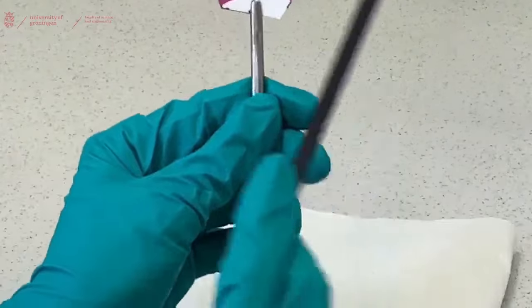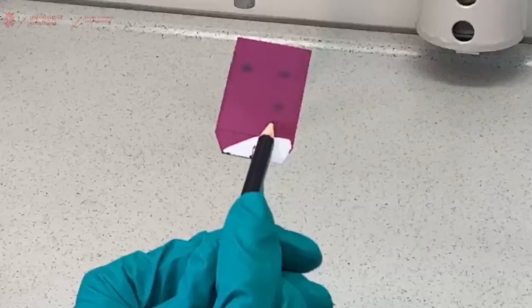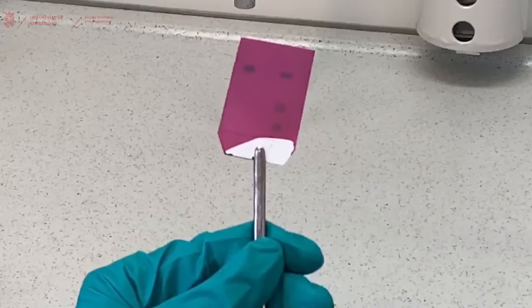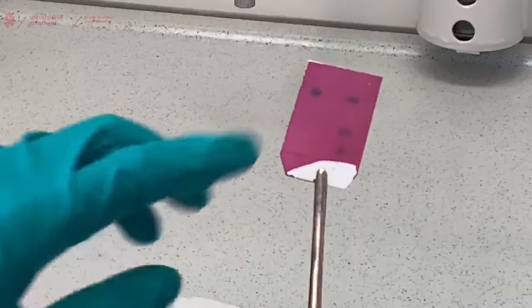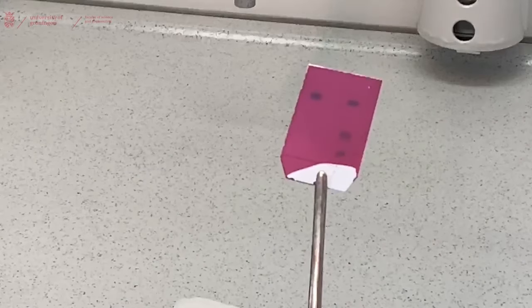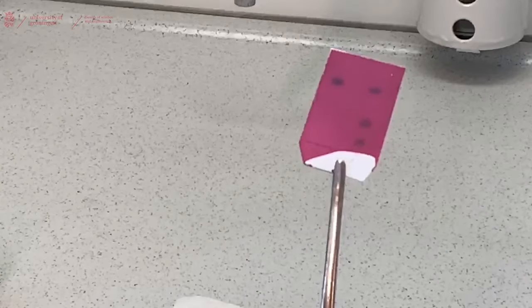Now we see that there is one more spot in the bottom of our product. And we circle that spot as well. Keep in mind that when using this technique you have to be careful with your TLC plate, because stains are often toxic and required to be handled with care. This is how you can analyze reactions using TLC.